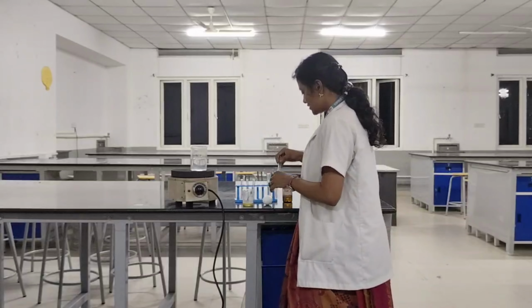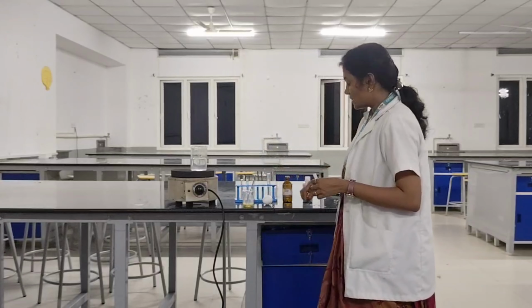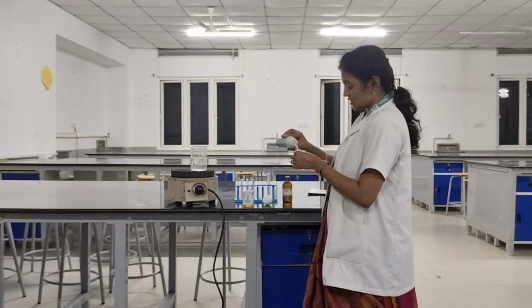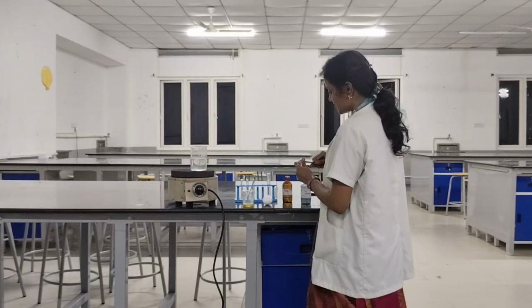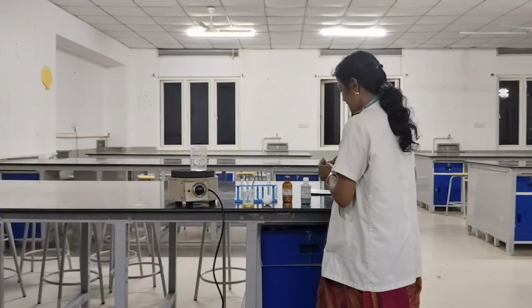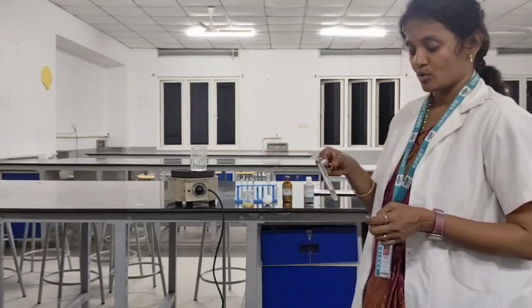The next test is the Biuret test. Here, to a small quantity of protein sample, like around 1 ml, we are adding the Biuret reagent. The Biuret reagent is a mixture of copper sulfate and sodium hydroxide. We can see the violet color formation, which denotes the presence of peptide bonds. Proteins are made up of peptide bonds, and this Biuret test confirms the presence of peptide bonds.